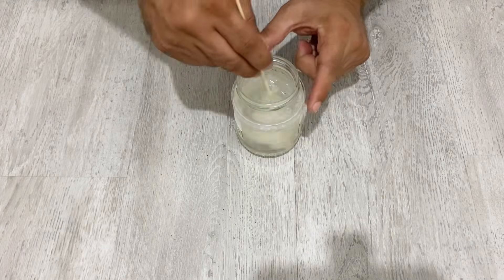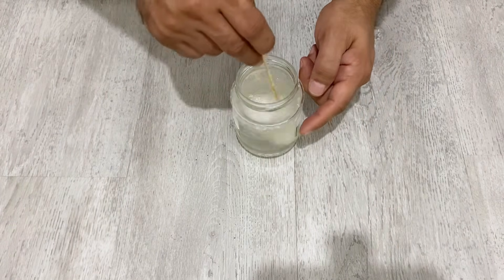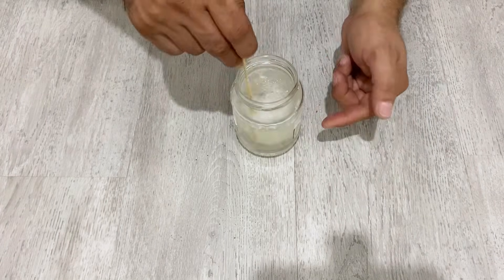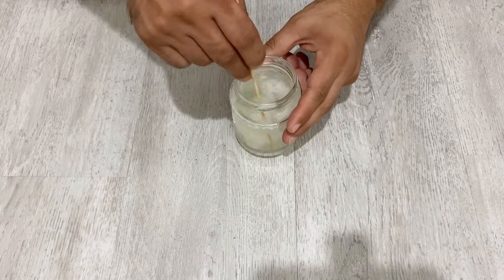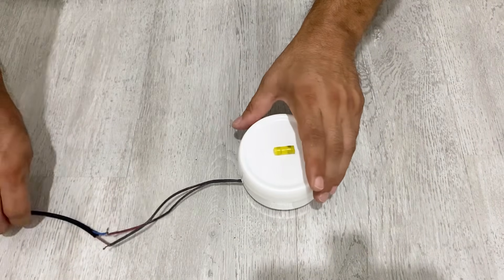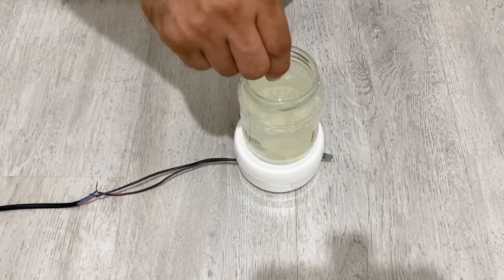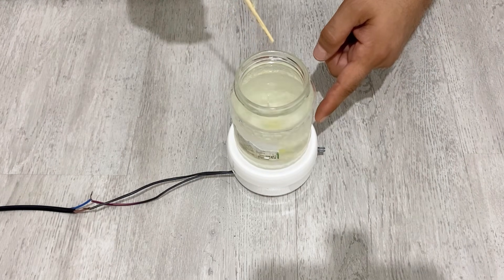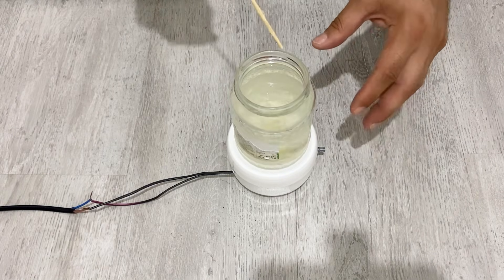We've added all the polyvinyl alcohol into the water. It takes about one to two hours to stir it, but I'm going to use a magnetic stirrer. After mixing for about one or two hours with the magnetic stirrer, I will wait overnight — it takes one to two days to completely dissolve the polyvinyl alcohol. While it stirs on the magnetic stirrer, I'm going to add sodium sulfate into the solution. I'll put my jar on my homemade magnetic stirrer and continue stirring.